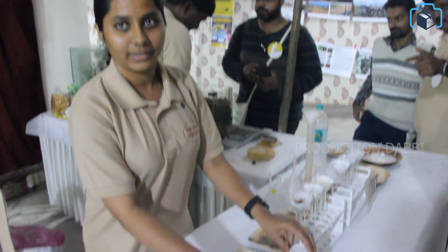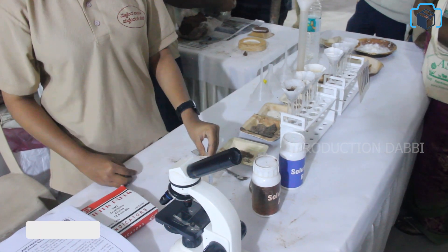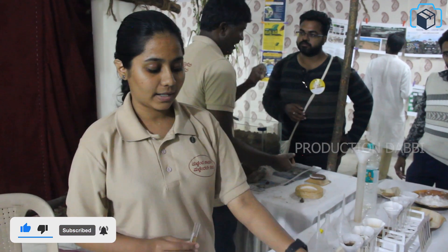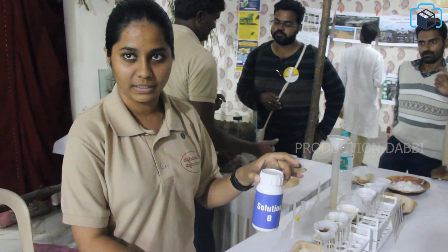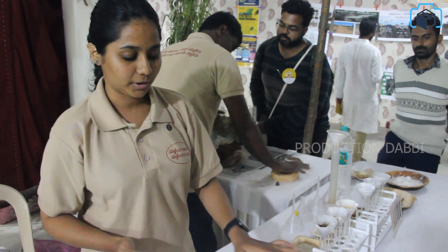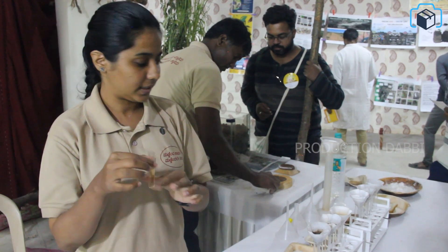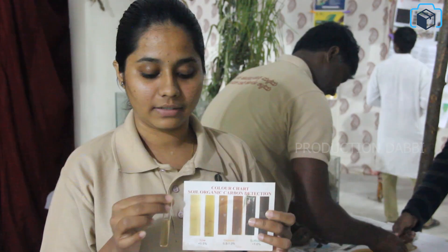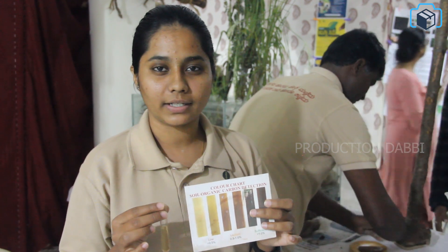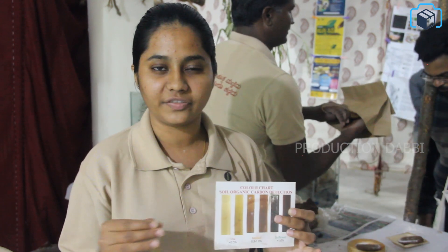You can test the organic carbon content in a simple way. Just 1 gram of soil, and there are solutions like solution A and solution B. We will add 10 ml of solution to the soil, dissolve and add it. There will be color changes in the tubes; we compare it to determine the organic carbon levels. Usually, there will be very low organic content.